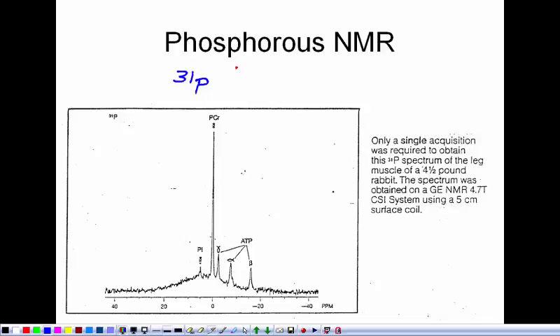If they have some impurities in there that have phosphorus in it, they want to make sure they just see one phosphorus peak and not that of the impurities. So there's lots of things. But in biochemistry, you can do phosphorus NMR to look at things that contain phosphorus, like energy molecules like ATP, or ADP or whatever.